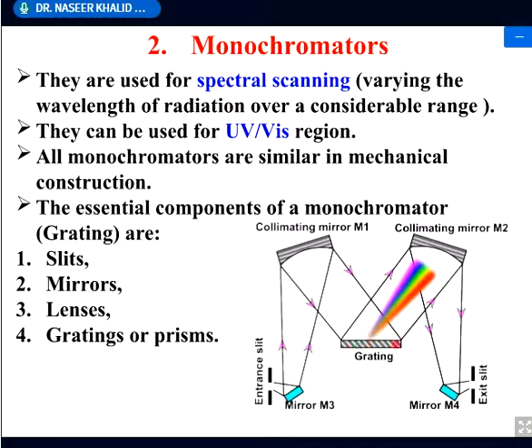Now, gratings. A grating is a special material in which there are certain grooves. When light passes on here, it will be diffracted at different angles. And so this light is converted into different colors. For example, this is violet, this is green, yellow, and red, VIBGYOR. And this VIBGYOR reaches here, again a collimator, and reaches this slit.